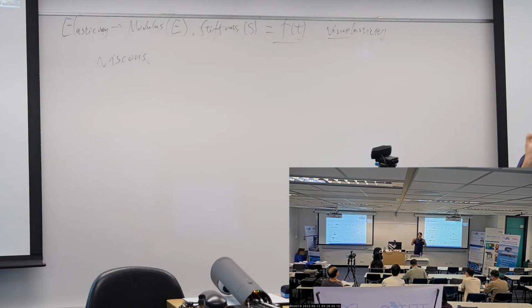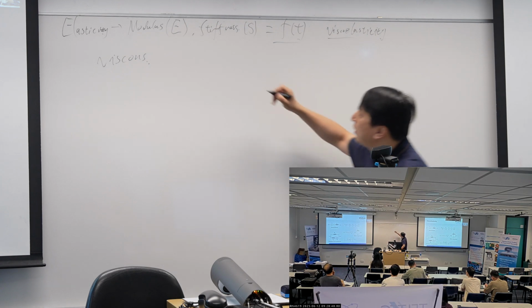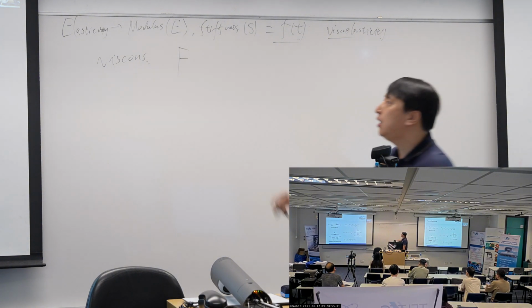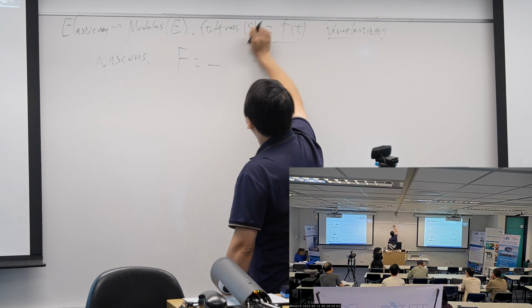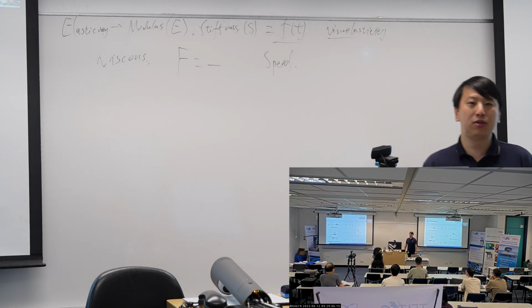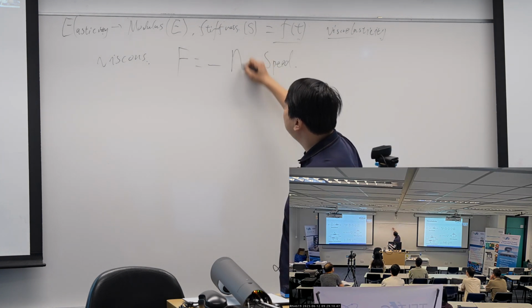To describe viscosity, we use the classic Newton's law. The hydrodynamic force we sense from the fluid is proportional to the speed, and the coefficient we call eta.